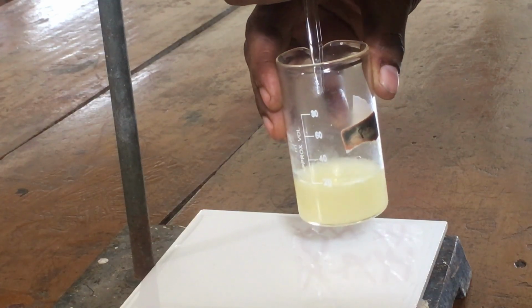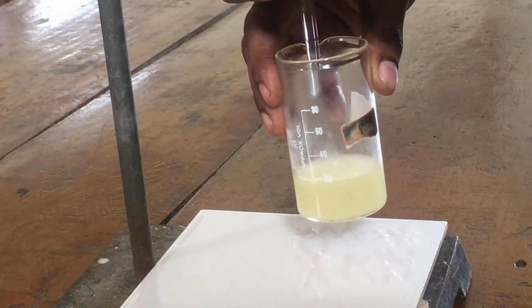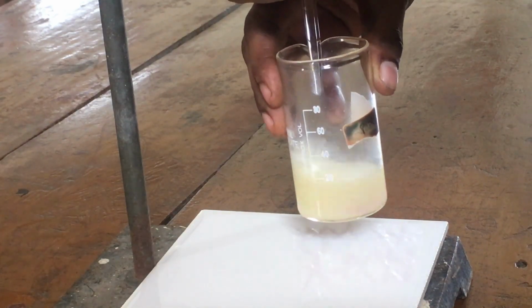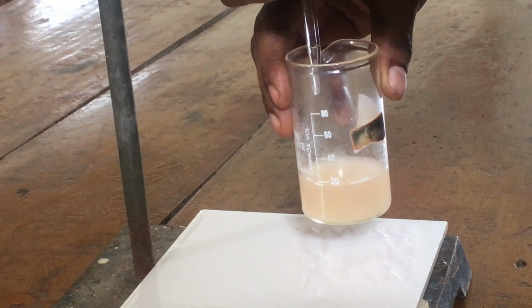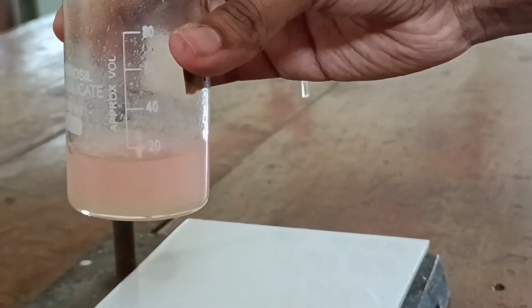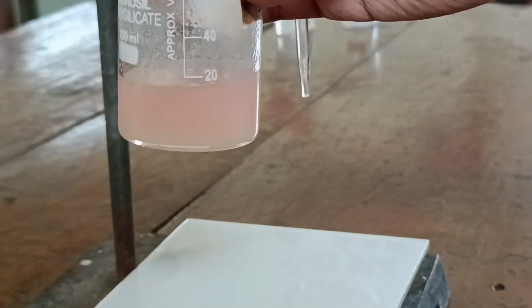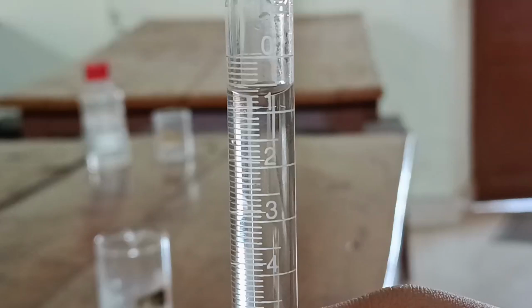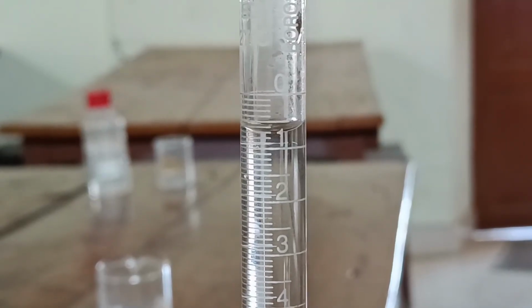The end point is a slight persisting pink color. We are almost going to get the pink color. Yes, this is the end point, slight pink color. Then we need to repeat the same procedure for rancid fat. For this fresh fat, we got 0.7 as the titration value.